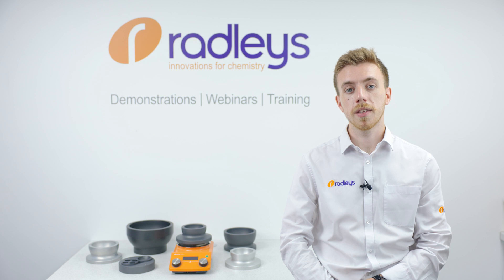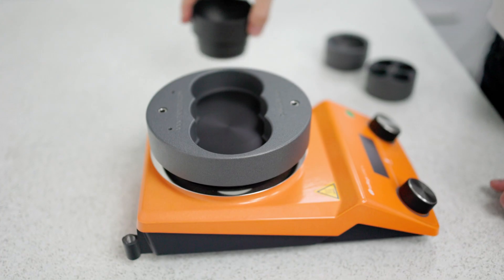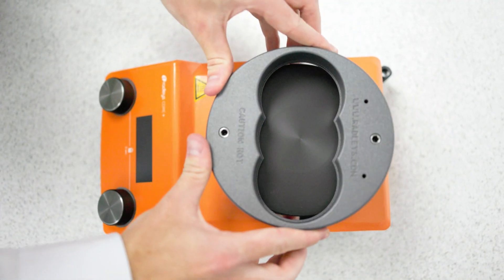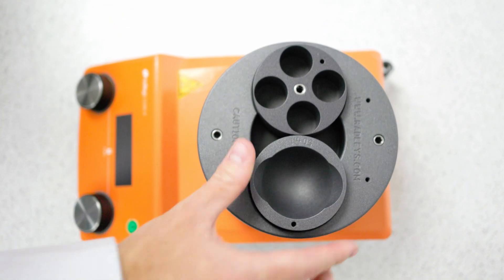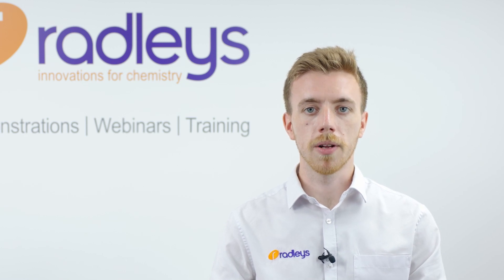The multi-well blocks will fit up to two flasks or one in the centre. These work with flasks from 10 millilitres up to 150 millilitres. These inserts rest on the hot plate surface itself, which means they heat up much faster than using inlays nested inside bigger blocks like you sometimes see. The single blocks work with flasks from 100 millilitres up to 5 litres.